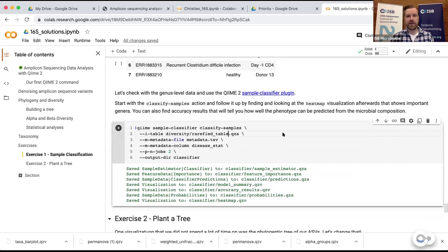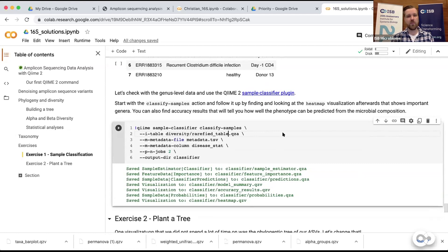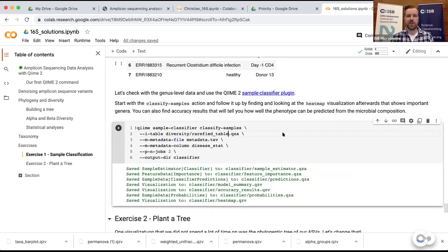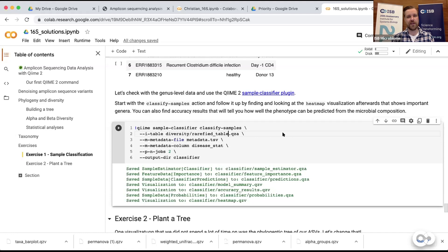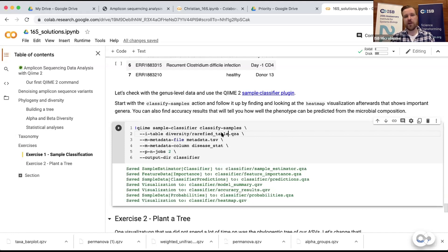Rarefied basically means that you sub-sampled each of the samples so they have exactly the same number of reads, which has advantages and disadvantages. The obvious advantage is that now every single sample contains exactly the same total number of reads, so you remove the effect of library size. But if you rarefied everything to 10,000 reads and you had 100,000 reads in a sample, you're only analyzing 10,000 of the 100,000 reads, so you lose some data.